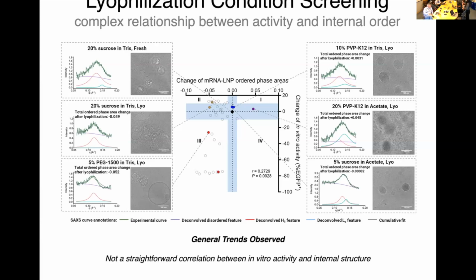Hello. When these LNPs are being manufactured at an industrial scale by Moderna, are they using a jet method or a microfluidics method or some other method, or do you know? I think the most common is still microfluidics. So you can produce the quantities needed. In fact, when they were testing that scalability, that was done using microfluidics. And I think they just scaled it up with their setup.